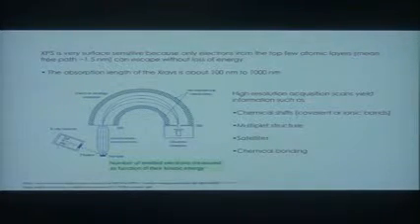If you see an XPS machine, it will have what looks like the top of a mushroom on it, made out of metal, a metallic mushroom head. And inside of that, you have two plates that guide the electrons. By varying the voltage on the two plates, you can determine what energy of electrons hit the other side. That's your detector on the other side.